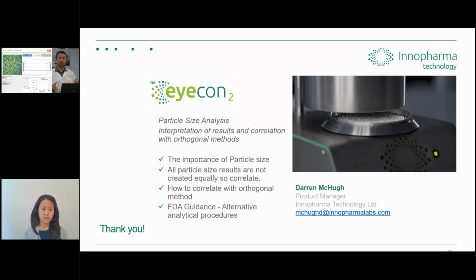So it does depend somewhat on what method you're analyzing, but also, something we will consider for integration is sample presentation and representation. Maybe this is a little bit outside of overlapping particles, but we would look into what material is being presented to the camera system. Is it representative of the process? Are we getting the full particle size distribution? And also, is it an accurate area to measure, in terms of there being no blockages in the process or anything like that? Thank you. That's perfect.